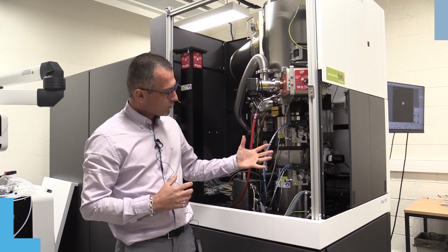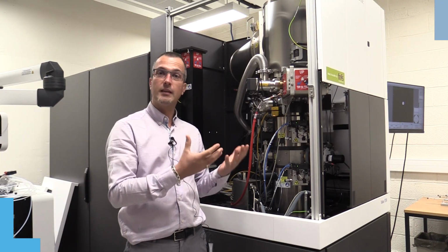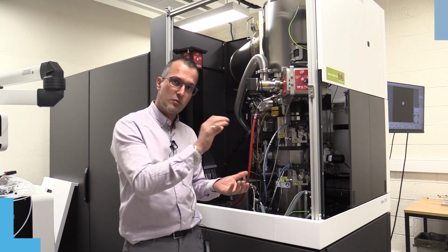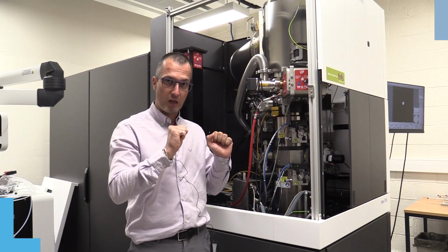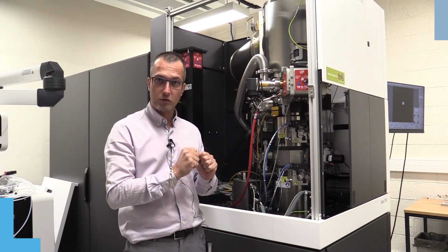On top of the microscope, we have specific holders which are able to do in situ measurement. Typically, we have one gas holder which injects a very small amount of gas at the surface of the sample, and we can then see, also in temperature, how the sample is reacting under those conditions.